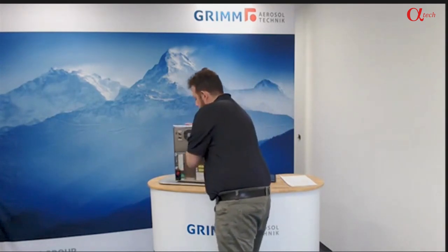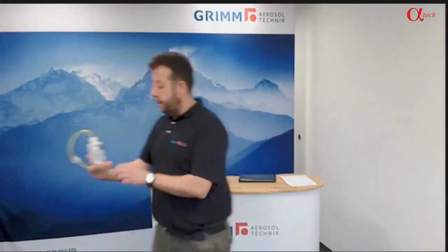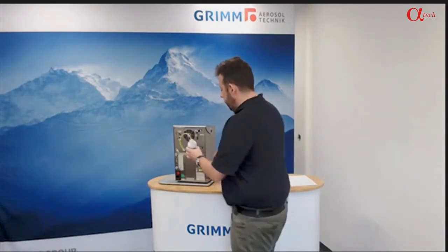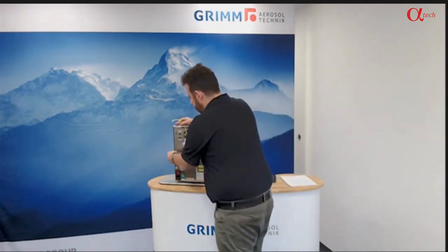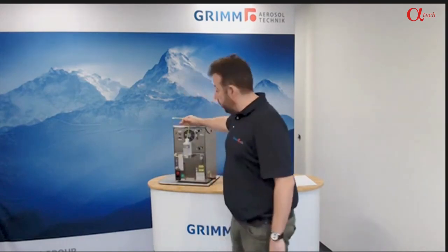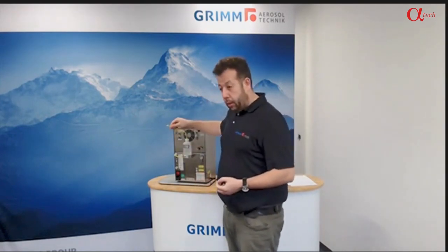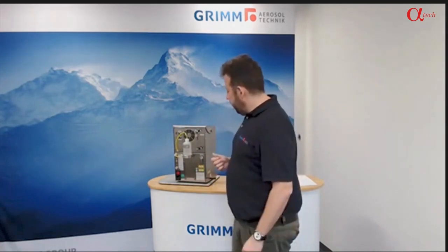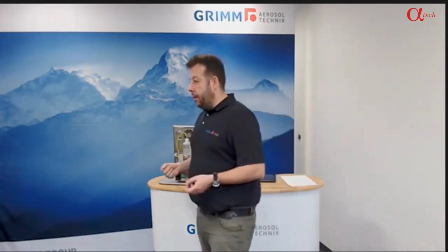The saturator key operates a mechanism that physically shuts off the CPC saturator from the condenser and the following optics. This is a safety feature so that when you move or transport the instrument, you do not need to drain or dry it completely. You just turn the key so the shutter closes and no butanol can physically enter the condenser or, most importantly, enter the optics and damage them. We then typically mount the butanol fill bottle and the condensate drain bottle using the magnetic snap-on holders.